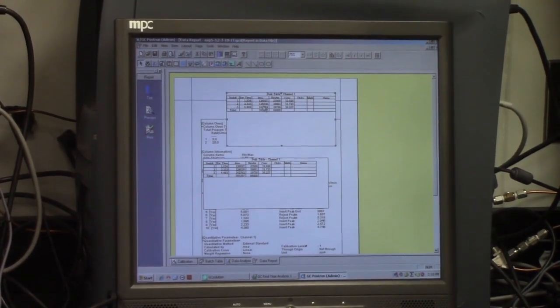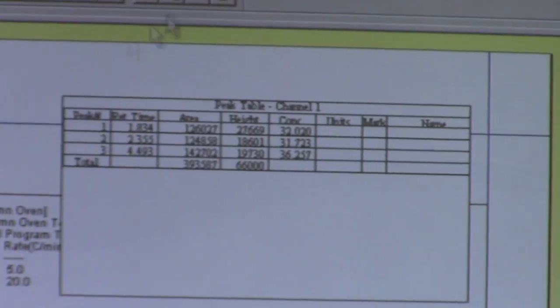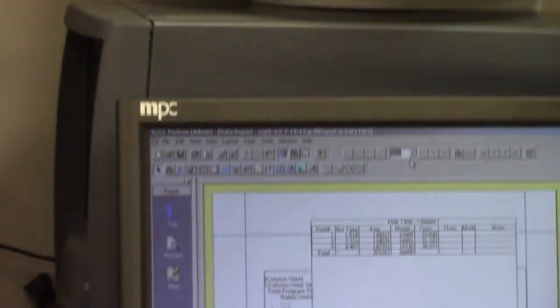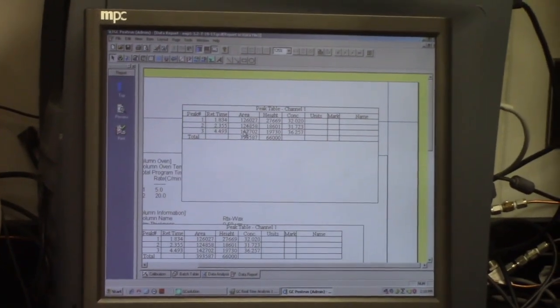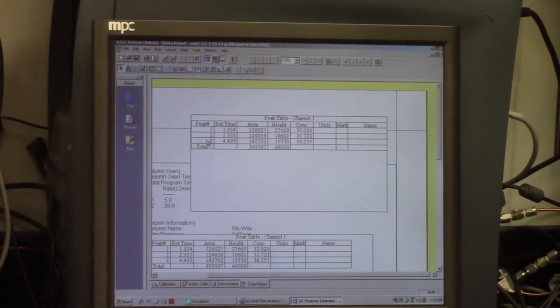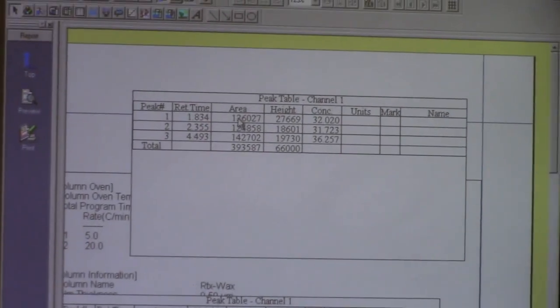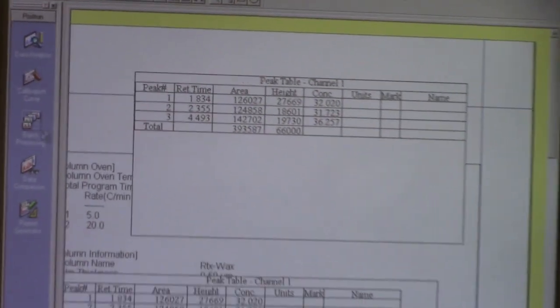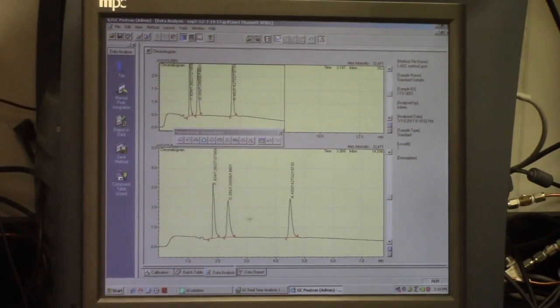And what you can see here, I don't know if you guys can see it. Let me try and zoom in. There you go. Can you guys see that? So the table we just inserted, we have our 3 peaks, 1, 2, 3, and we have the area and their retention time shown. This is the integration area, and you can use this to compare them. So then we go back, and so we know peak 1, peak 2, and peak 3.